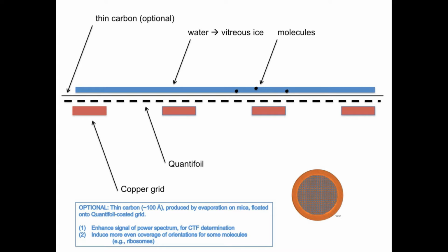So here are all the different layers. We have the water or aqueous liquid with the molecules inside of this. We have the optional thin carbon. We have the Quantifoil here, and we have the copper grid.